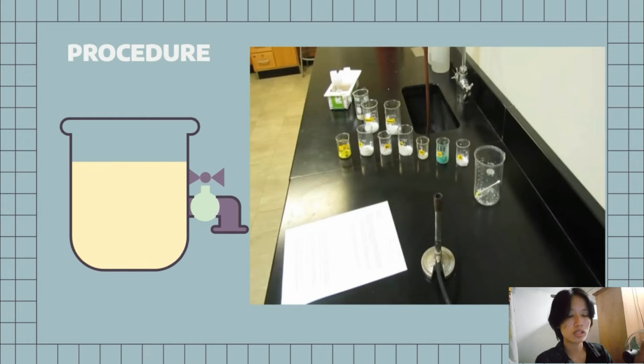Also, the purpose of dipping the Q-tips in water is so that when they place them in the flame, they won't burn, because the main goal of this flame test is not to burn the material you are using. It's just to observe the colors of their solutions.